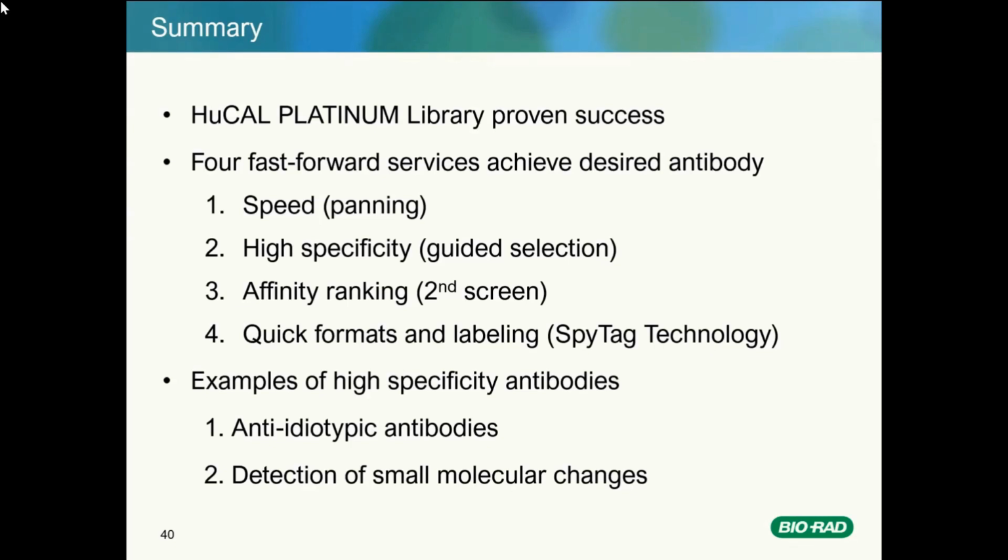Lastly, we discussed examples of high specificity antibodies like anti-idiotypic antibodies and antibodies that can detect small molecular changes.